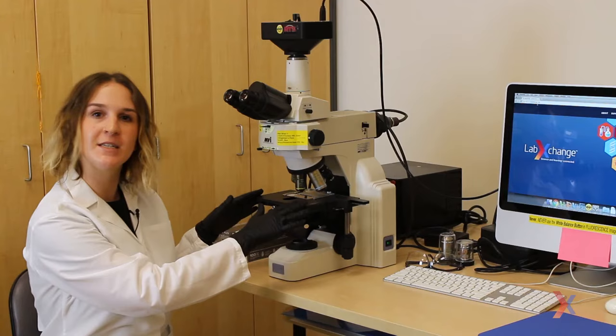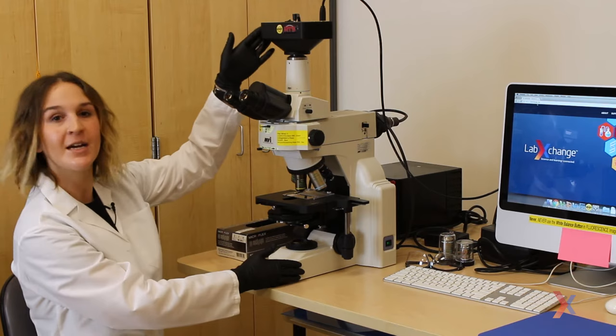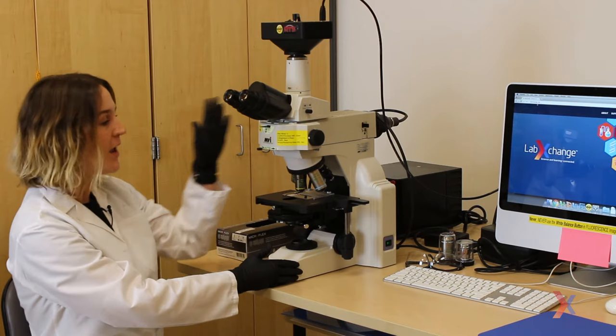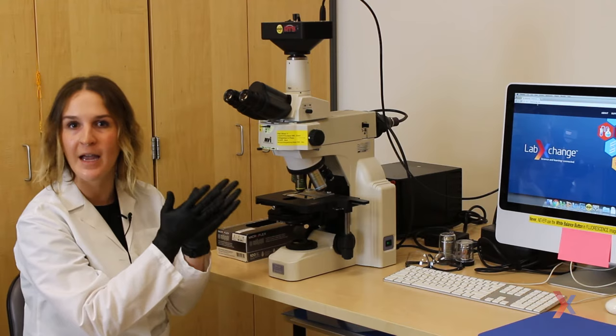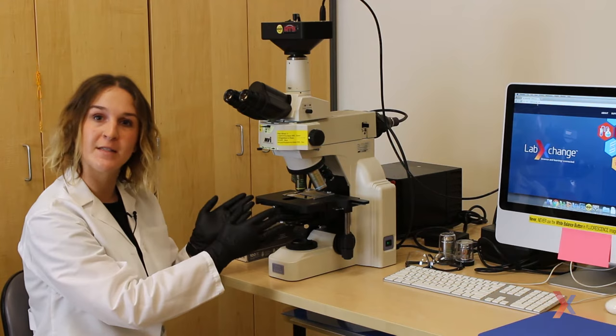We'll put our slide first on the stage and this stage is sitting in between our light source at the bottom here and our detector at the top which is our camera or it could also be your eyes if you look through the eyepiece. And we have a few elements in between our light source and our camera that help us direct the light where we want it to go.